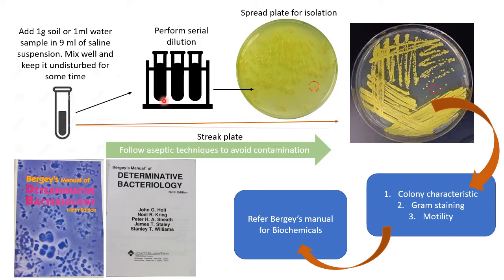While you are performing these isolation techniques, you need to follow aseptic techniques to avoid contamination. It is easy to identify contamination in a streak plate, because if a colony is growing out of your streak line, then it is a contamination.